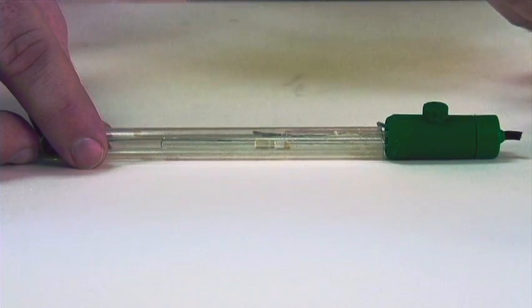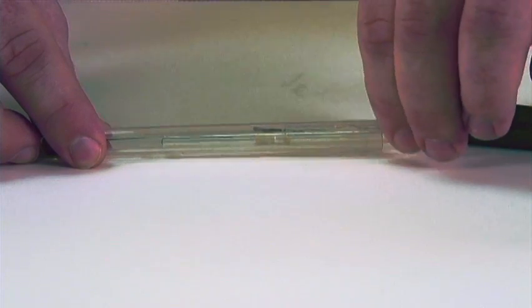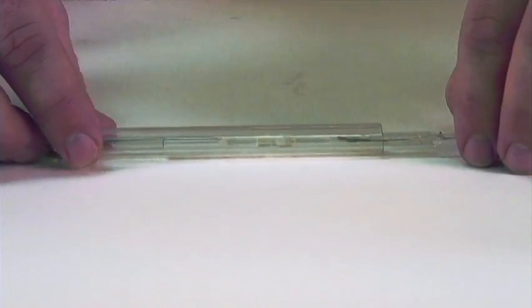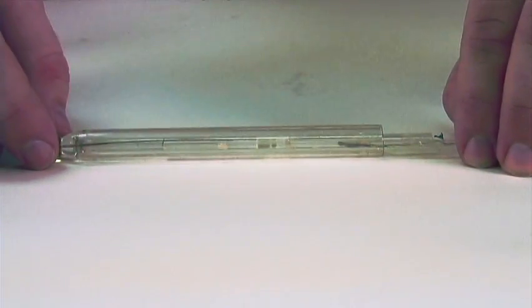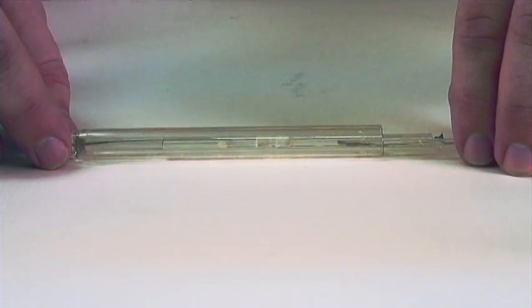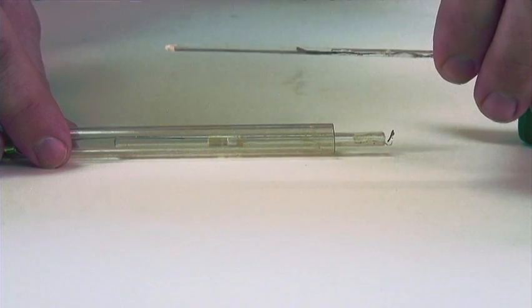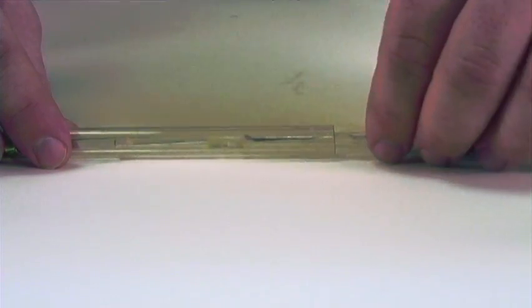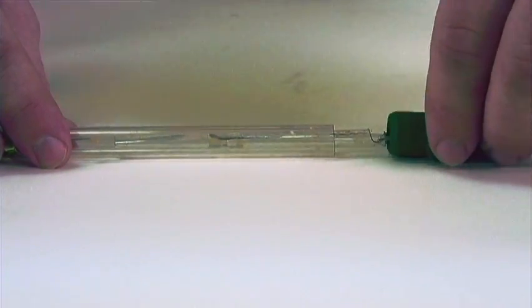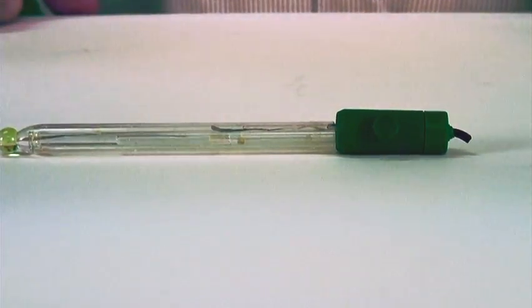This can clog the reference junction, so by adding a second tube in the reference chamber we will only fill the outside reference chamber with 3.5 molar KCL solution without the silver, and on this inner tube we will add the 3.5 molar KCL solution with silver in it so that the silver is not going to come in contact with the heavy metals or tris buffers, preventing a clogged junction.